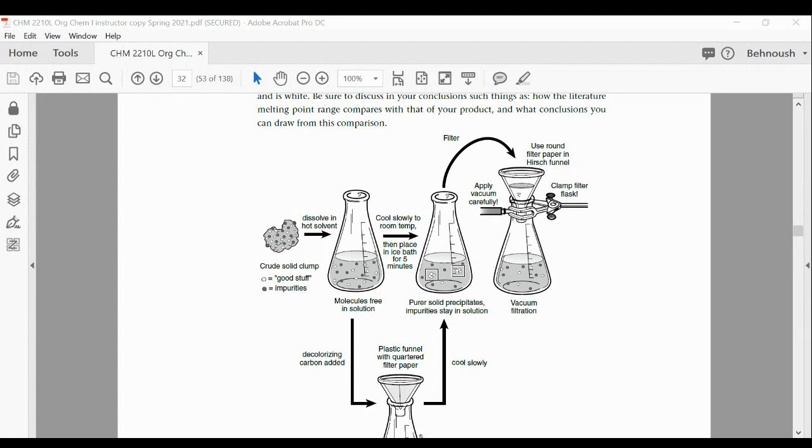No, the mass of deionized water you don't have to include, because deionized water is the solvent, and that's quantitative. So no, you don't have to include it.